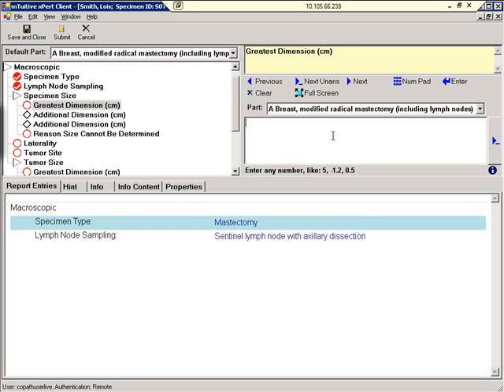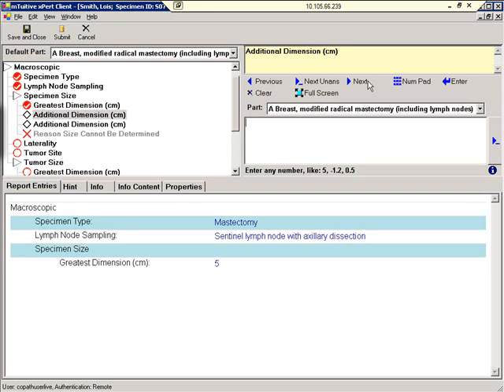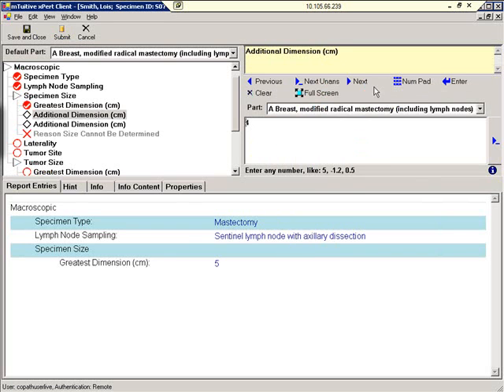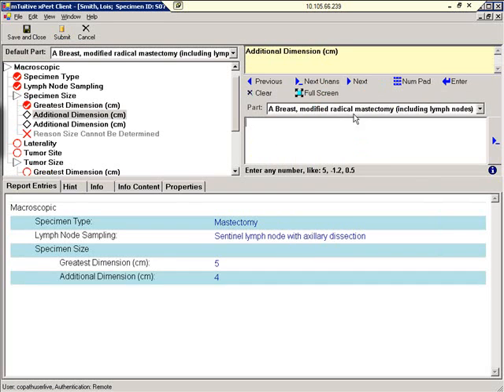Specimen size, greatest dimension. Five. Let's use the number pad to enter the additional dimension. Four. And the final additional dimension, three.